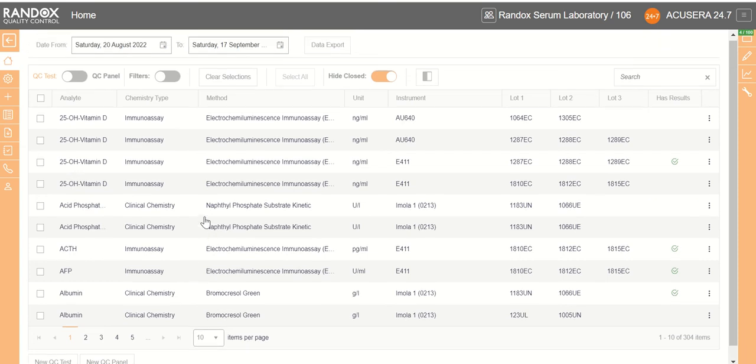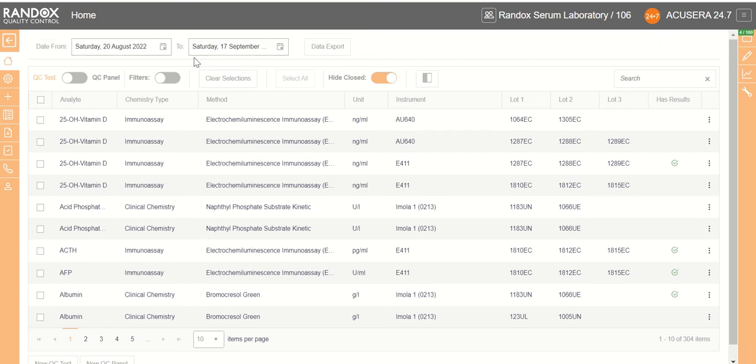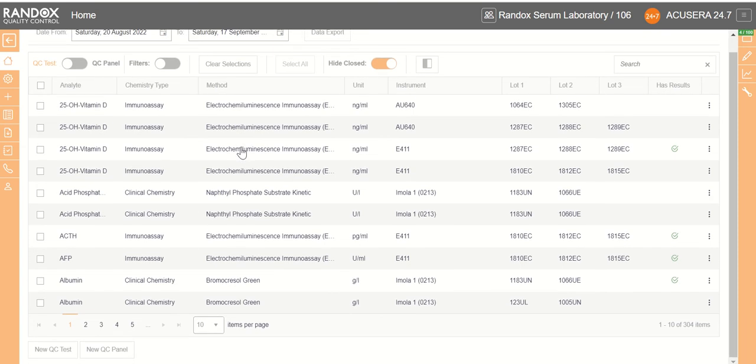To do this, come to the home page, scroll to the bottom, and click on new QC panel.